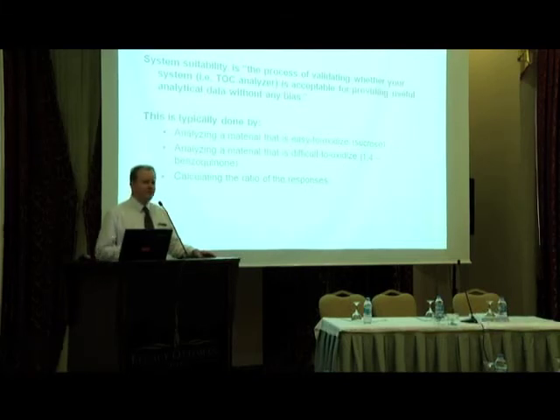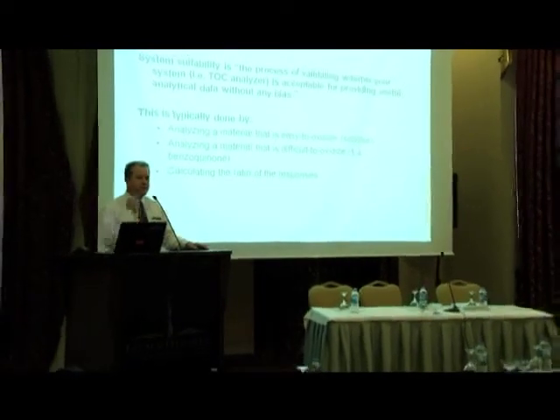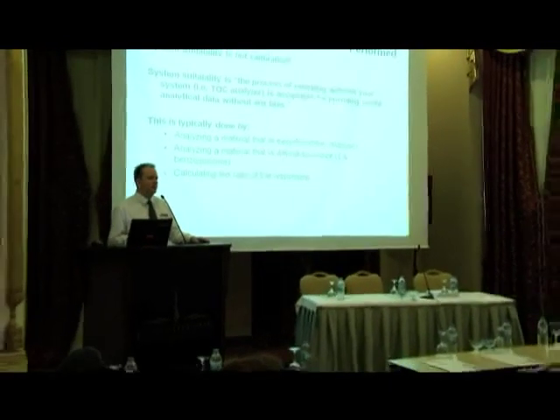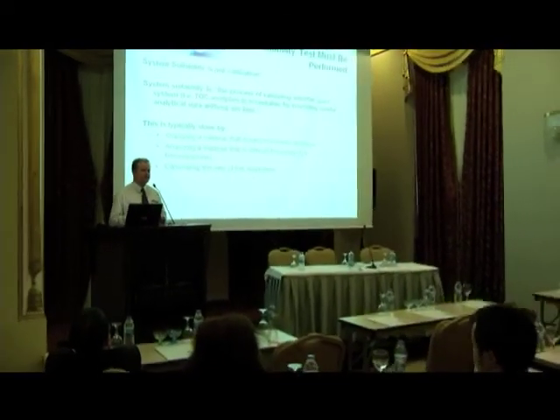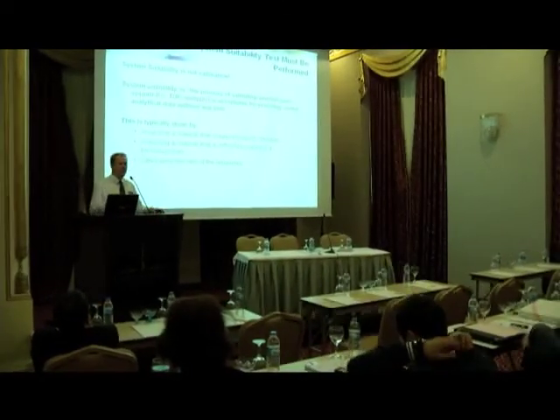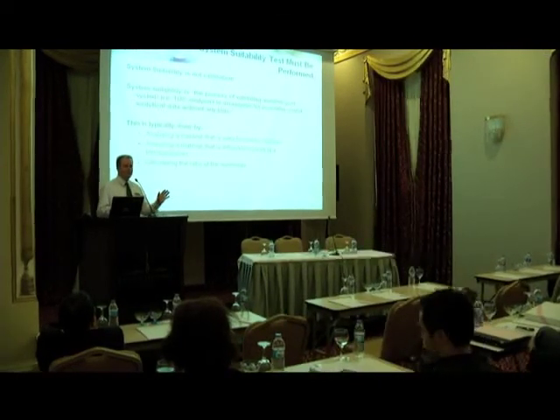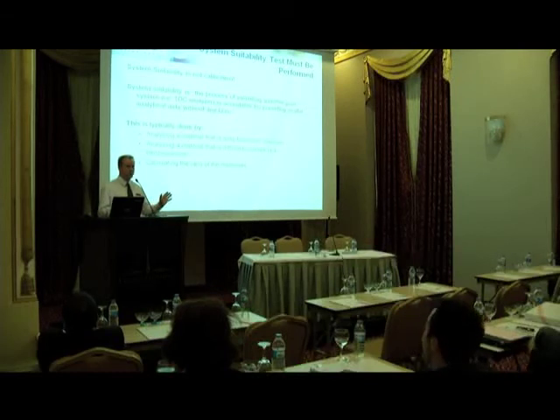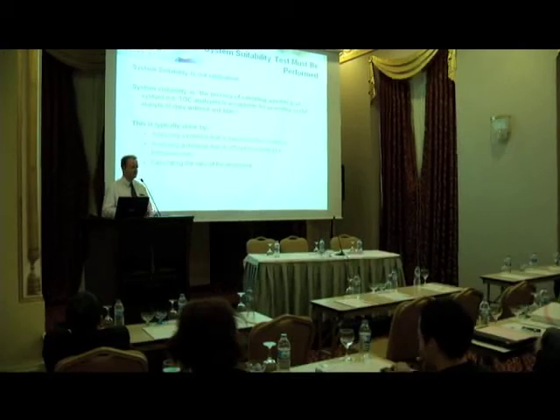Now, talk about the system suitability test. The system suitability test for TOC analyzers is really a performance check on the analyzer. What it's trying to establish is, can this TOC analyzer analyze the range of organic material that we will have in our water systems? So we test it with a very easily oxidized substance, sucrose, and then we test it with a difficult to oxidize substance, benzoquinone. And we test the two and we check to see that the analyzer will analyze both of these materials correctly.